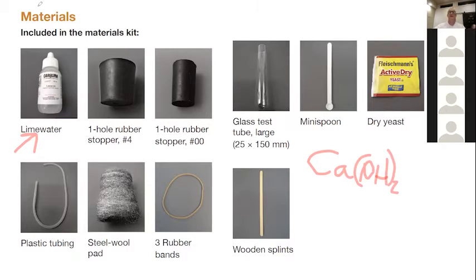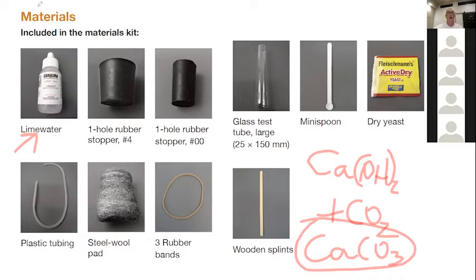Excellent. So calcium hydroxide is not terribly soluble. It's just barely soluble at room temperature. But when we put CO2 in there, you get calcium carbonate. And calcium carbonate is limestone. So that ain't soluble. So that is the suspension, hopefully, that we'll see. So I'll try and do that reaction for you guys, but I will show you how it works and the reaction that actually takes place.